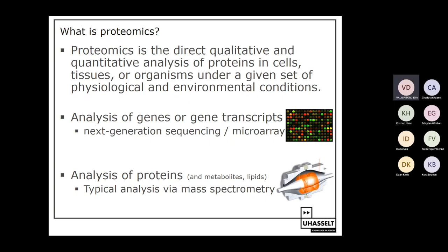There are some changes nowadays where proteins are also being analyzed with what I call closed box solutions, like Olink proteomics and SomaLogic proteomics. I will not discuss these technologies in this series. We will only focus on what I call open box solutions, and that is mass spectrometry.